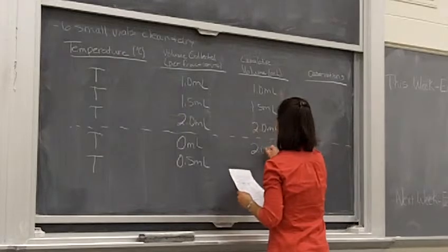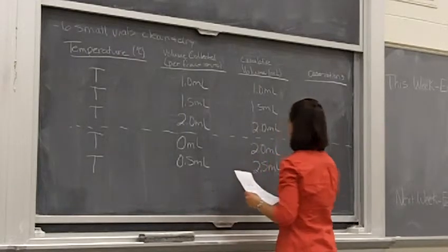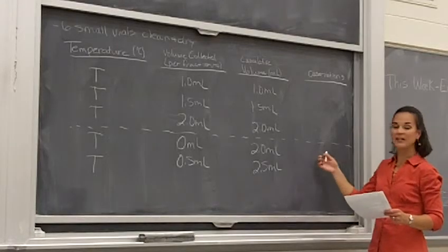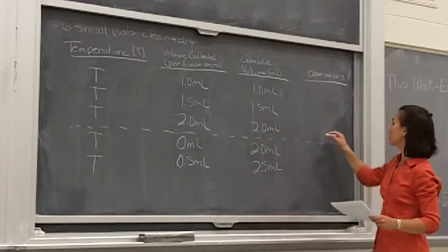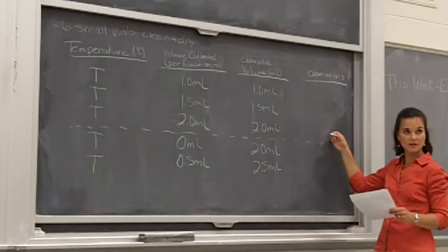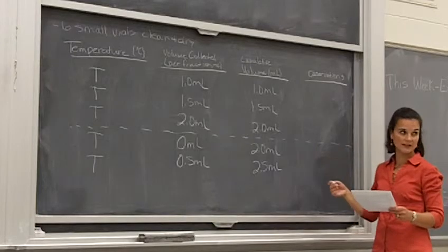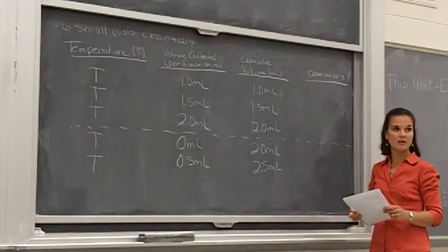But then you keep adding. Okay, so does everybody see how that works? Okay. In this table, make sure it's very clear where you're changing out your graduated cylinder, so you can put a dashed line in between. But also in the observations part, make sure you put that you've changed the graduated cylinder. Make sure if you've changed the heating setting that you put that. Make sure you give the initial heating setting. Okay. So in this observation side, make sure all that information is filled out.